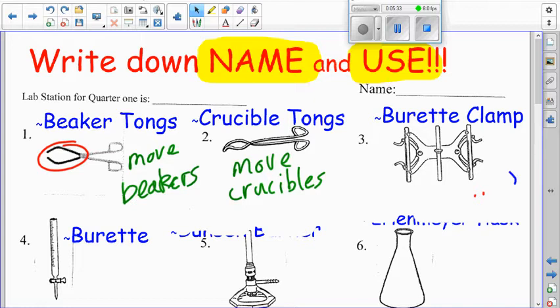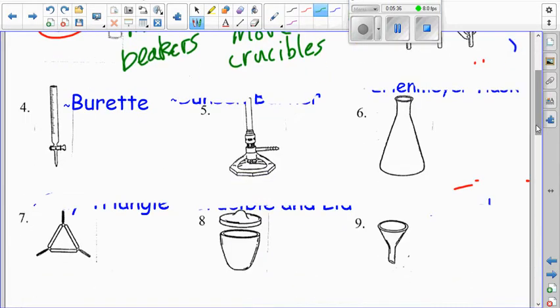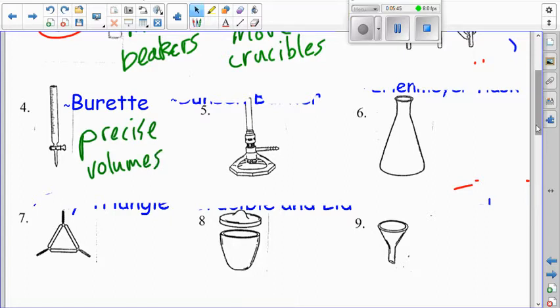But a burette is used to measure precise volumes, okay? You can measure down to the hundredths of a milliliter with a burette. They are very precise. You know exactly how much you are adding of whatever you're using, which will probably be a base like sodium hydroxide when we get to unit 7. We're talking about titrations and the pink color and don't kill Patrick Star, and it's a whole thing. We'll get to that, but it'll be a while.